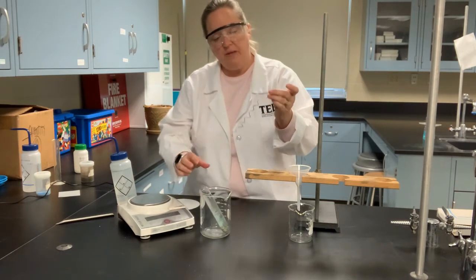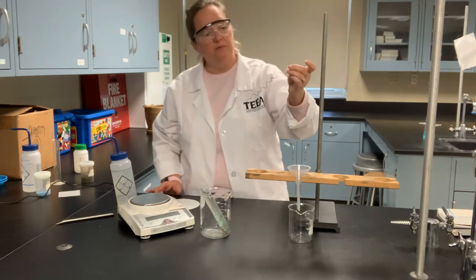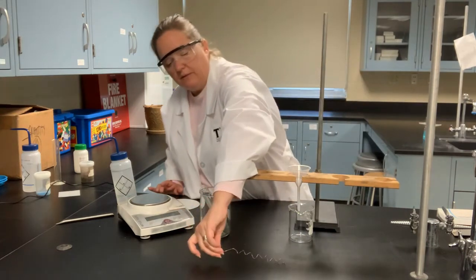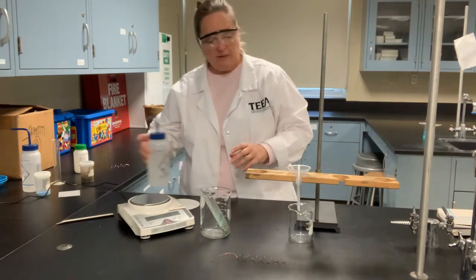And I have it, and I've gotten my copper coil pretty clean. So I've removed the silver crystals from it, and now I'm just going to set it aside. We'll place it there on the table out of our way. And now I'm ready to harvest my silver crystals.